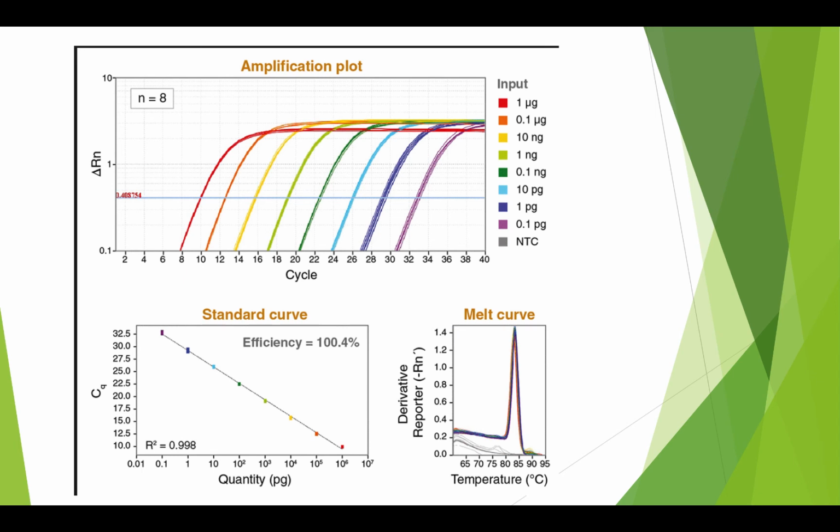So the amplification plot, what we really want to see here is the number of cycles. The more template DNA, the more primers, the more polymerases, and the more dye I have, making new fresh double stranded DNA. This means you will have much earlier detection on a larger input, for example 1 microgram of DNA.